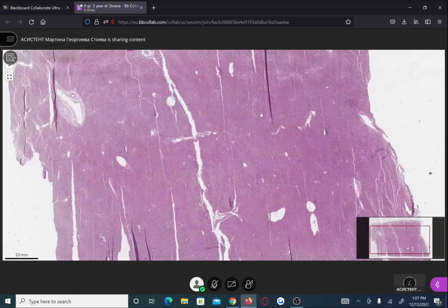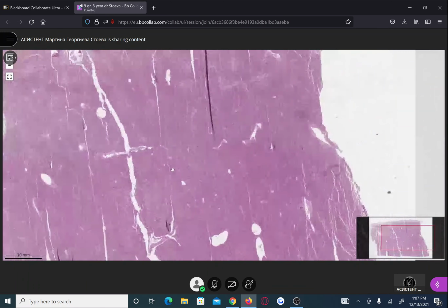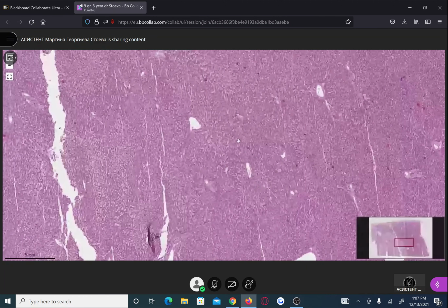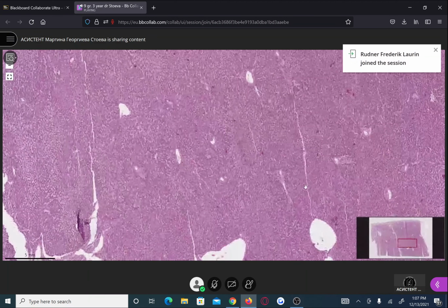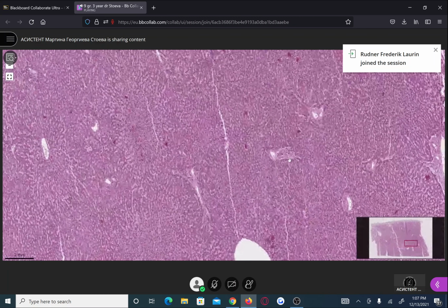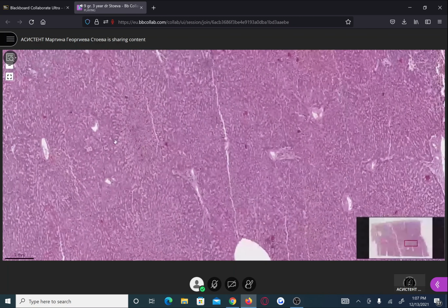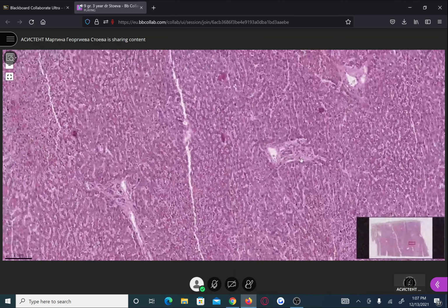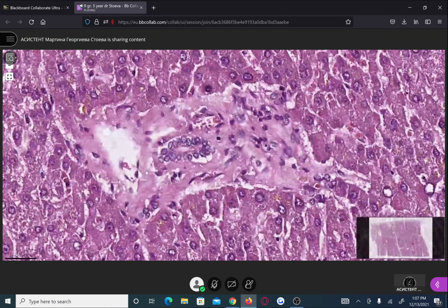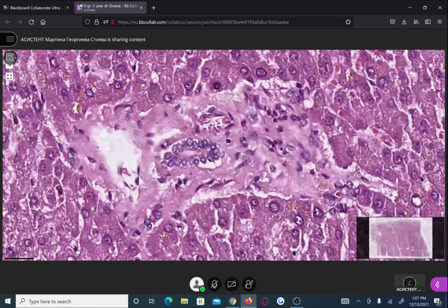In the morning, we already mentioned how we recognize the liver. We use the medium magnification to see some round to oval structures with several lumina inside. And then we zoom in at these zones to see exactly where the blood vessels are. And this is the bile duct lined by cuboidal cells with round nuclei.